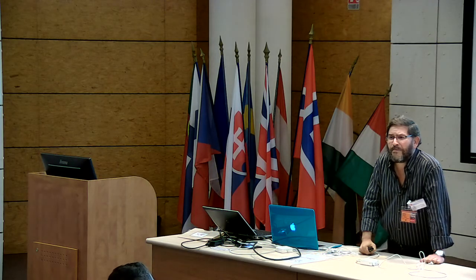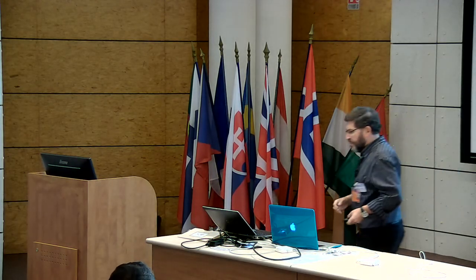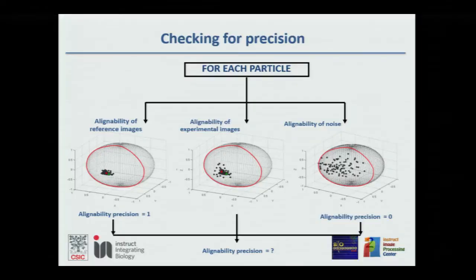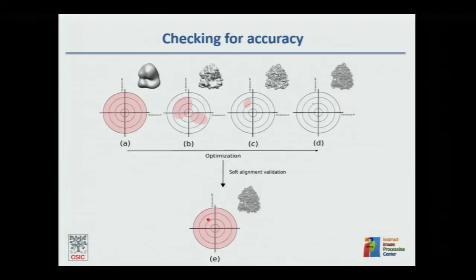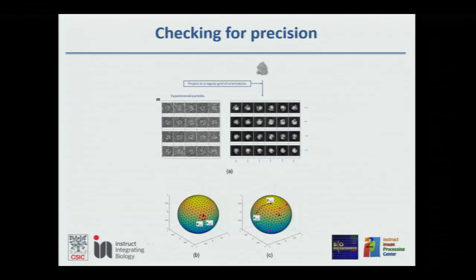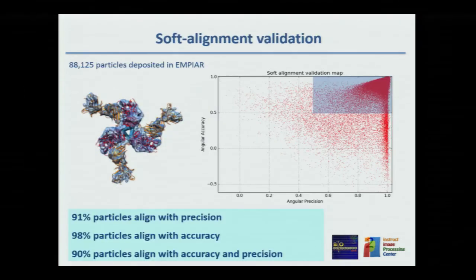Yeah, what if we did the converse of Hong's experiment? You take all these orientations and you take an initial model of the influenza spike. Will you get the influenza spike back? I bet you will. I'm saying that if you go back to those two plots, because we did this experiment, if you took our orientations and put an influenza spike back, you won't get it back.